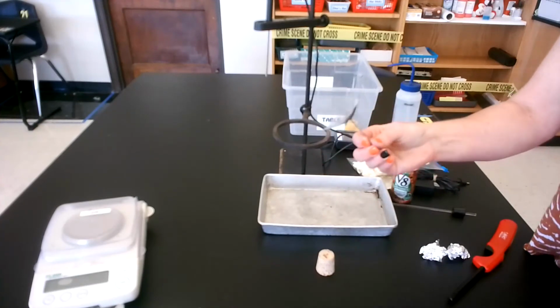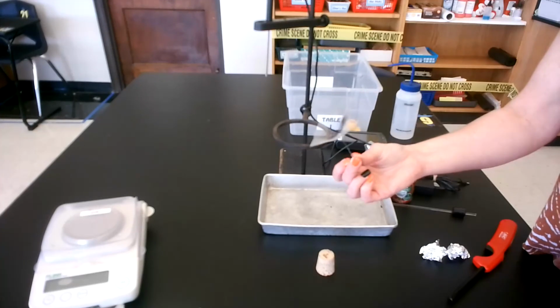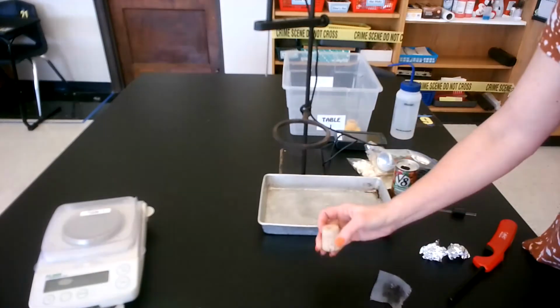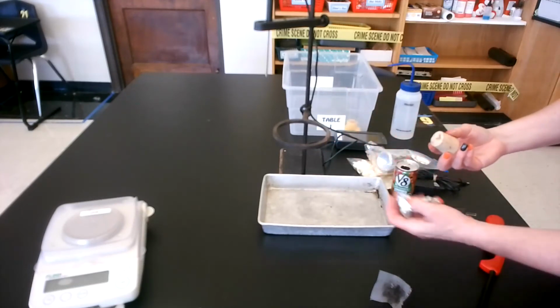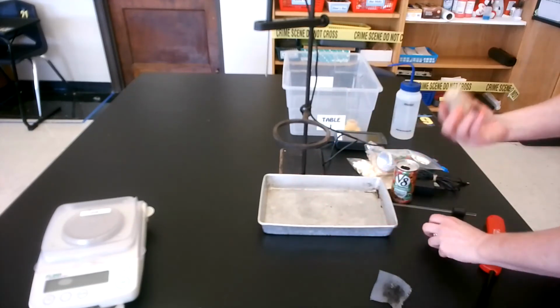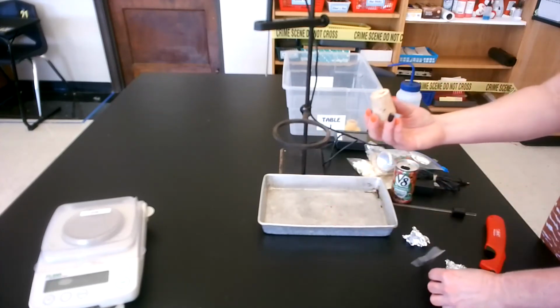This screen and paper clip, I try to use it as much as possible before I have to make new ones. So this is going to go into a soapy tub. This cork, do not throw this cork away. So foil, food, trash. I'll have a bin that we can put all this in at the sink. Soapy tub to be washed.